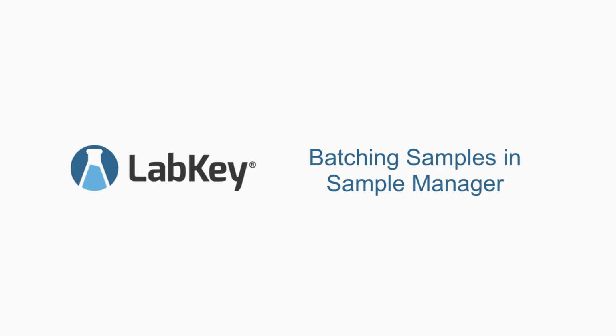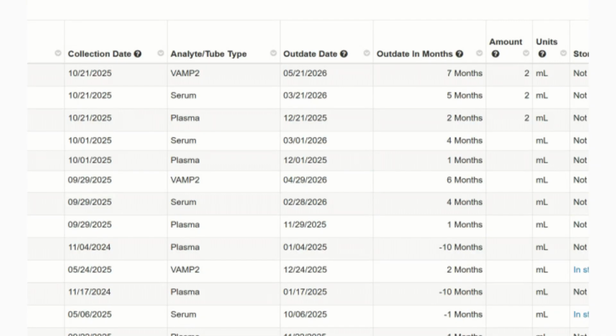In Sample Manager Professional, you can easily group or batch samples together using calculated fields. These fields can consider when a sample will outdate for testing depending on the type of sample that is being used, the test being run, and the collection date or any other combination of data fields. In this set of data, we can see that an outdate is being calculated based on the sample's collection date and the analyte or tube type being used. We are also calculating how much time is remaining before a sample outdates for testing.